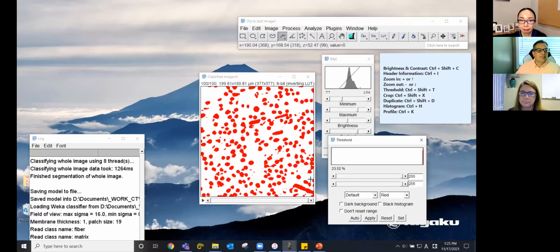Okay, another couple questions here real quick. One is from Francesco. Is it possible to, I'm thinking he says kill the borders, but I think he means frame the image to avoid particles that are not fully in the field of view? I know that we can do that in Dragonfly. I can't think of an easy way to do it in ImageJ. If anybody knows, let us know.